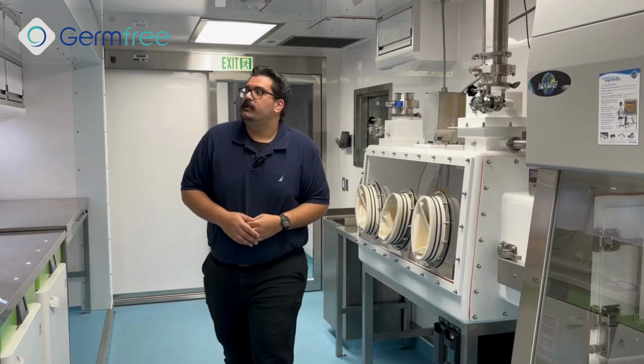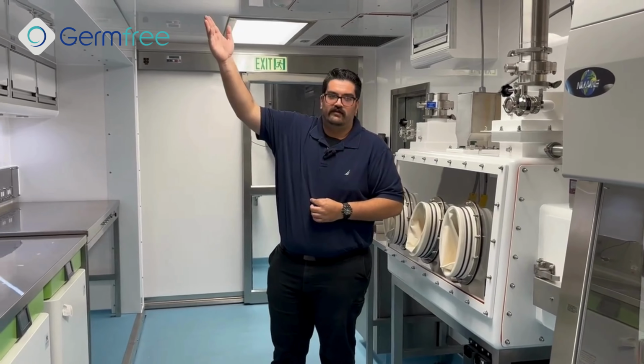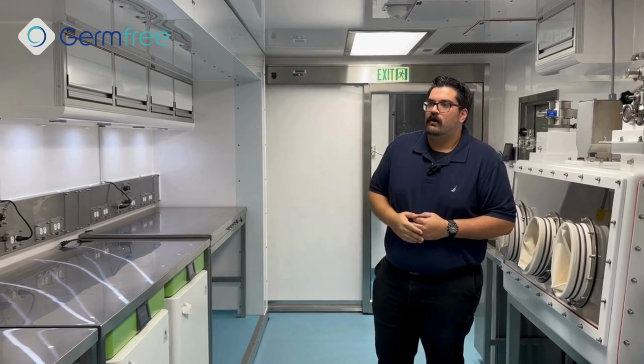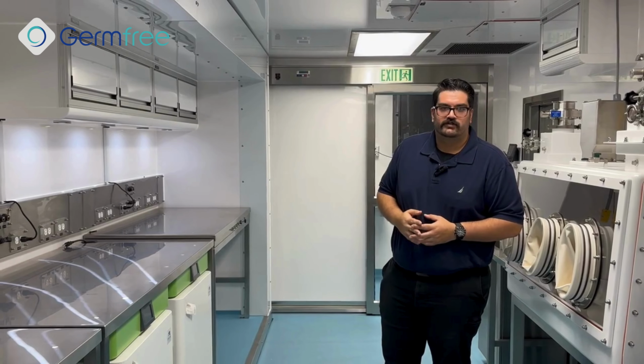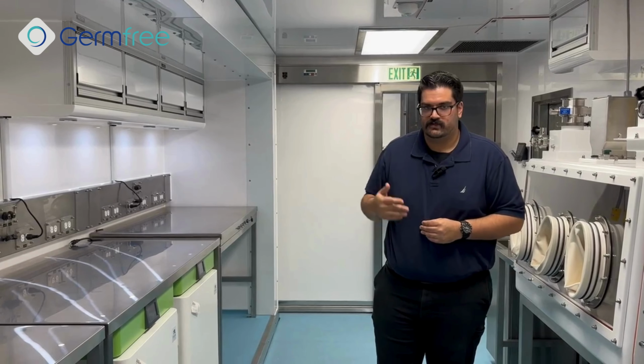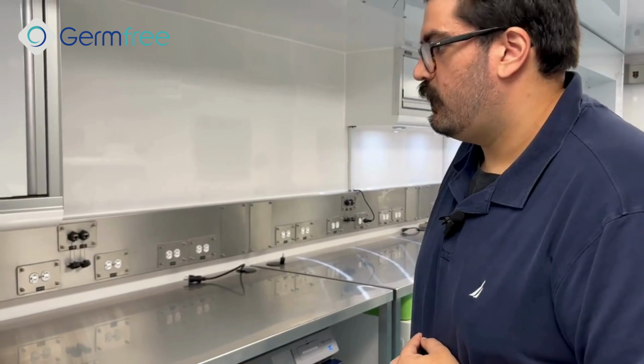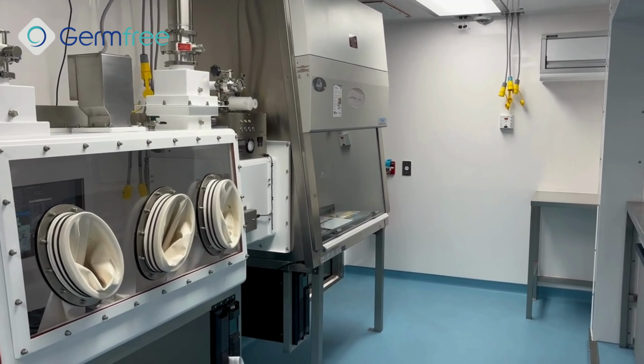Going to the MEP, this trailer is just outfitted with stainless steel registers for both supply and return. All of the HEPA filtration is in the mechanical room via a bag in, bag out housing, both on the supply and exhaust. Moving back here, again, more fridges and freezers, as well as some more storage and casework to my right. It's not currently installed as we're not providing it, but there also will be a top load autoclave in here to decon any process work.